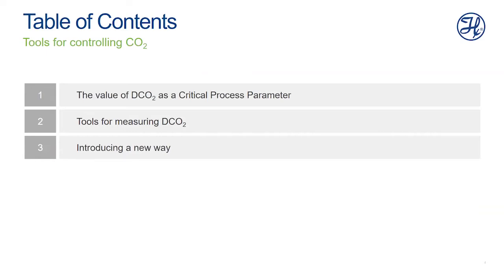So we'll begin today with a brief discussion of how CO2 changes throughout a bioprocess and the importance of controlling it. We'll review the current technologies that are available for measuring CO2, finally leading to the development of a new dissolved CO2 sensor.